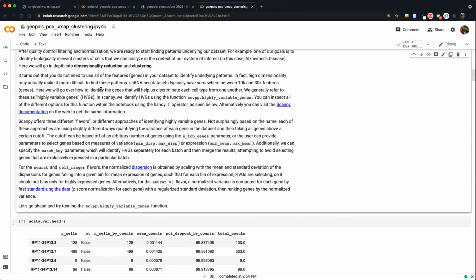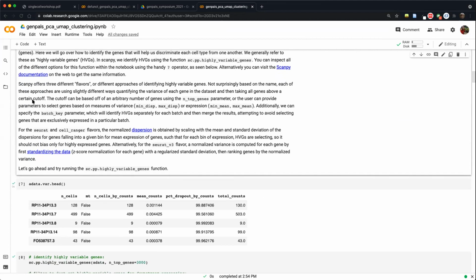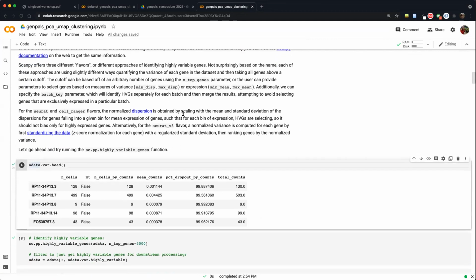Yeah, so that's one of the difficulties of trying to teach single cell analysis, is how much it loops back on itself. So we're trying to give you a logical flow of it while realizing that there is actually no logical flow.